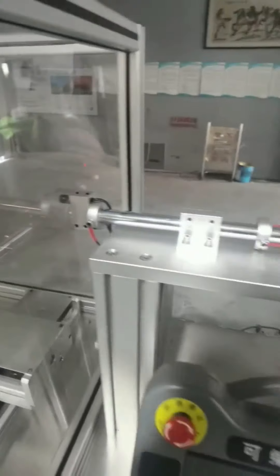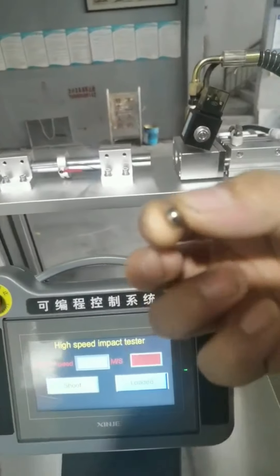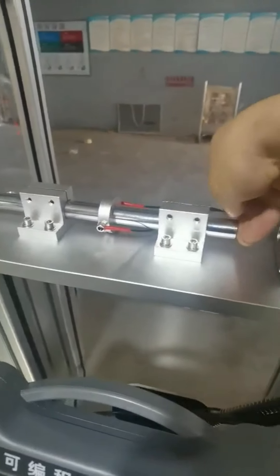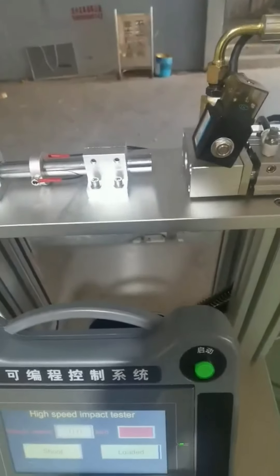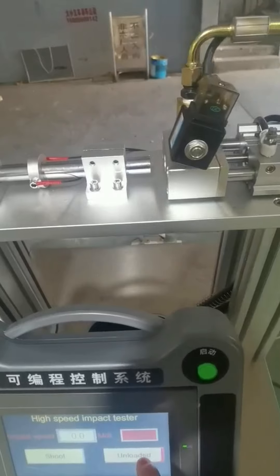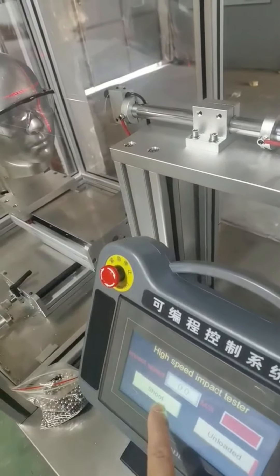Close the safety door. Place the steel ball into the shooting rod. Choose loaded, then choose shoot, and it will test automatically.